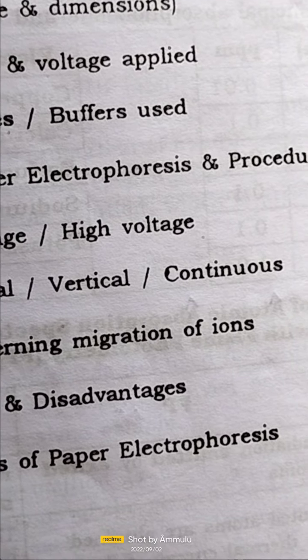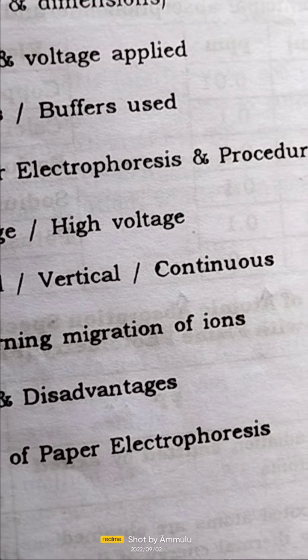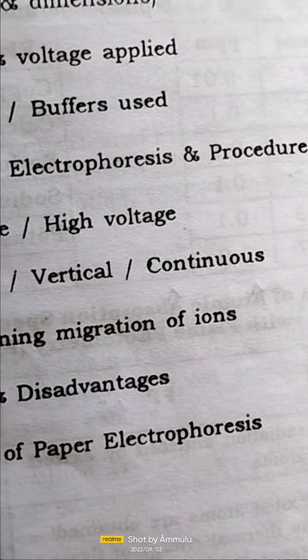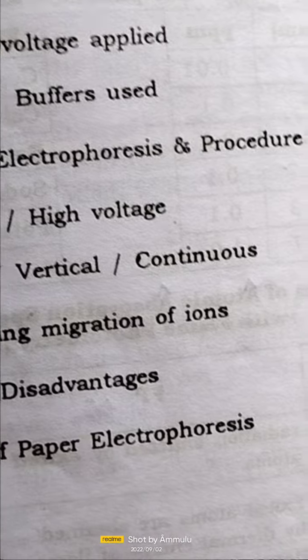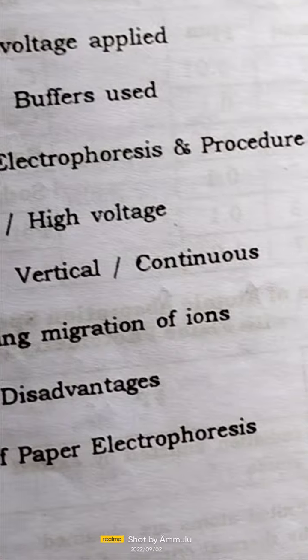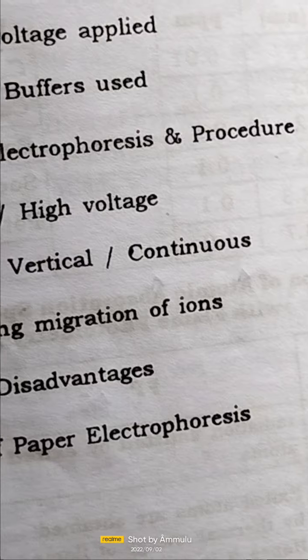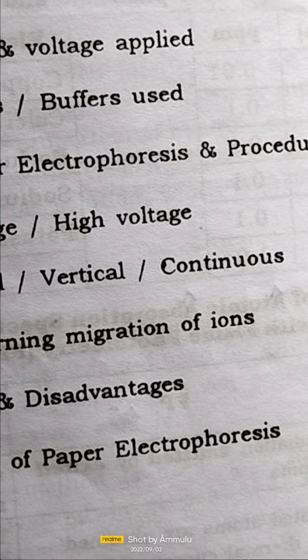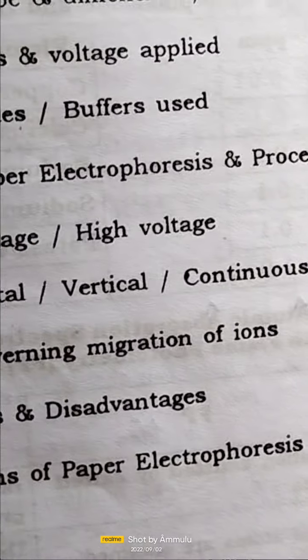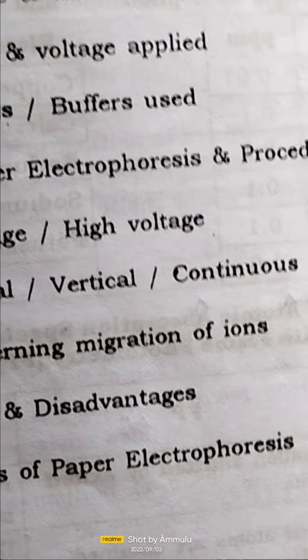When a voltage is applied across these electrodes, the ions migrate towards the anode or cathode based upon their charges, and they are separated to different sides. Neutral or non-ionizable substances do not migrate. For example, anionic substances move towards the anode and cationic substances move towards the cathode. Ultimately, there is a separation of anionic, cationic and non-ionic substances.